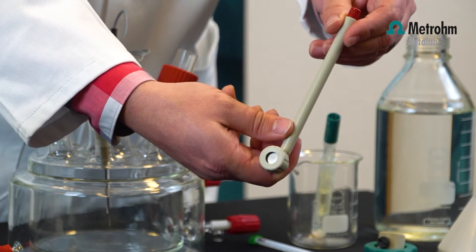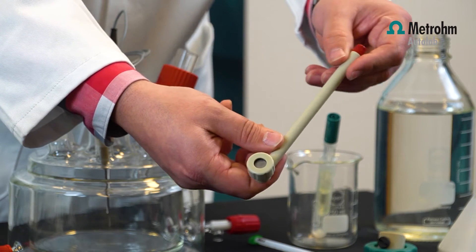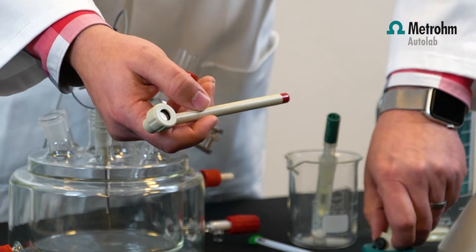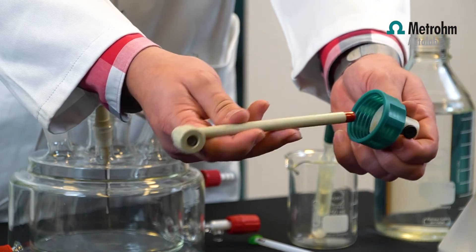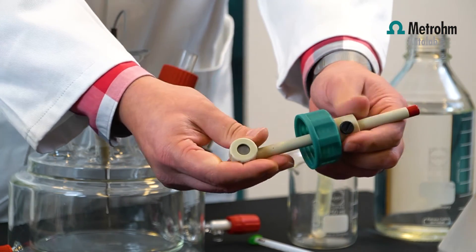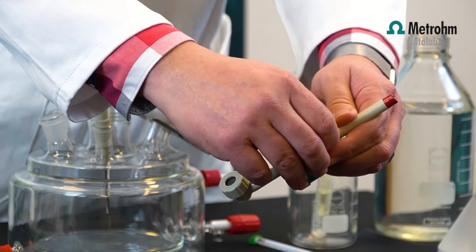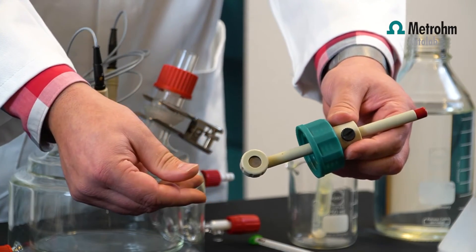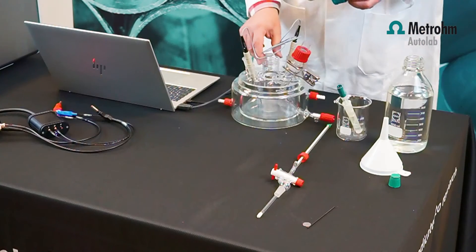Now you have the sample prepared. This is your sample which you're going to use. You connect this to the top cover and you can tighten the shaft with this ring.